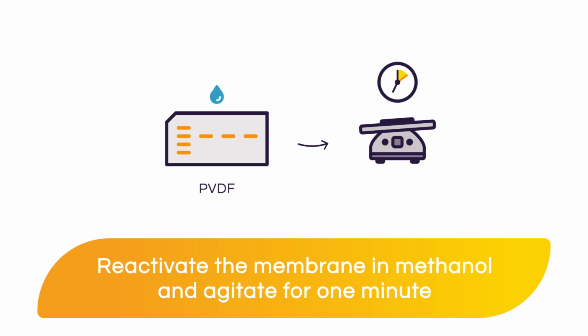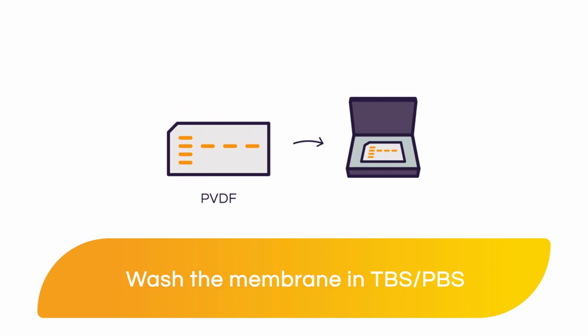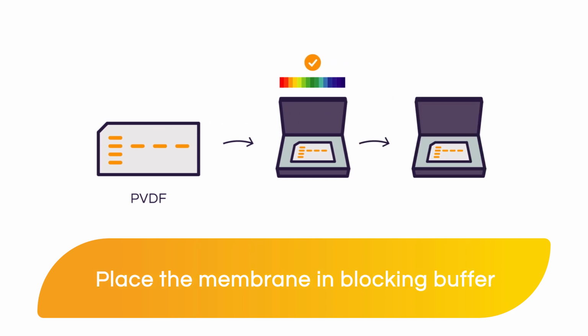However, if it is a PVDF membrane, you will first need to reactivate it in 100% methanol with gentle shaking for 1 minute. This is an important step because it allows the PVDF to become hydrophilic. You can then briefly rinse it in pure water to remove the methanol, and then, as with nitrocellulose, soak it for 2 minutes in TBS or PBS. After this rehydration, your membrane is ready for blocking.